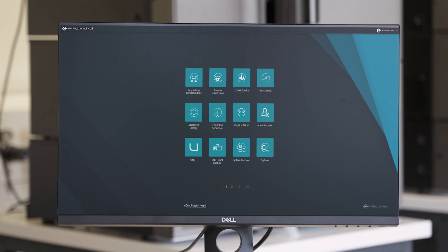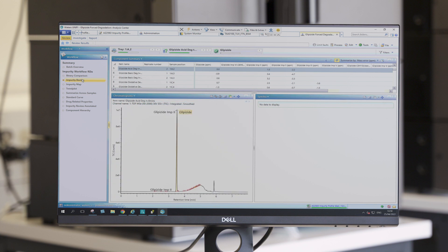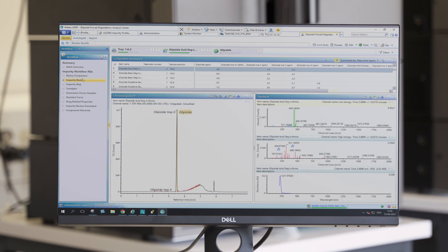The system is controlled by the compliant-ready UniFi application as part of the Waters Connect software platform. Streamlined workflows within UniFi allow for a stepwise investigation of the data, enabling quick appraisal of any degradants produced to detailed profiling of degradants over time. A typical targeted workflow would involve creating a library of known degradants using mol files, which are text files containing structural information for a single compound, and using that library to screen the data collected for any degradants formed during the experiment.